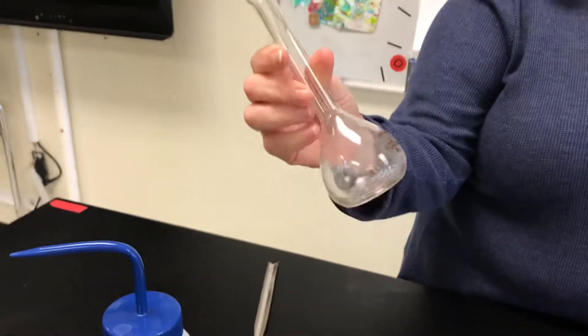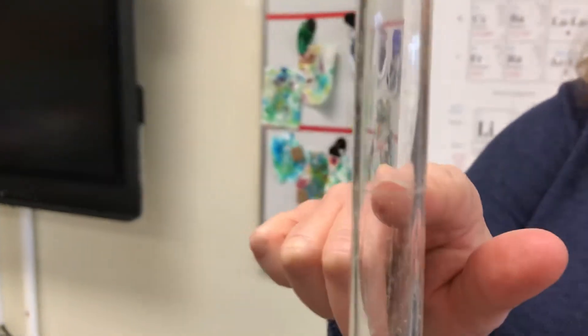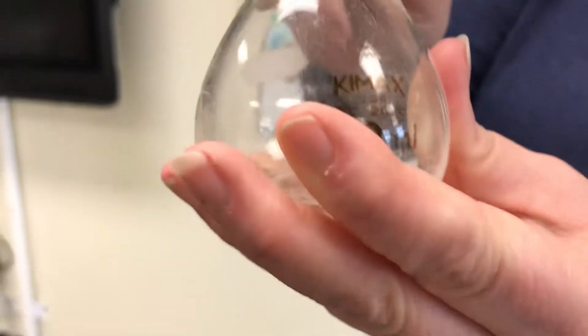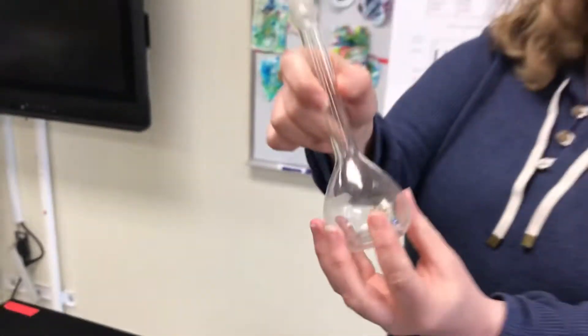Now what is this? So this is a volumetric flask. You'll notice that there's not a lot of markings, so it's not like a graduated cylinder. We have just one marking, and this is the marking that's going to indicate exactly 100 milliliters. And it's got a round shape so that you can swirl and mix.